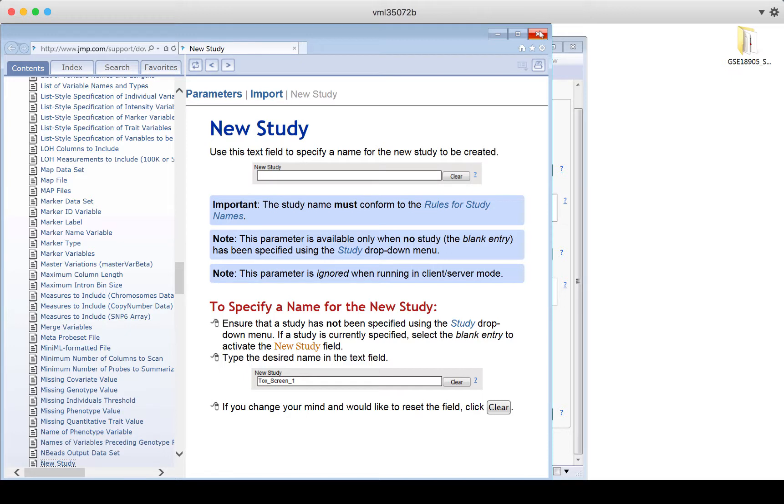Each data type when you're importing has its own quirks. So use the help documentation. It will point out special or different things that you need to know or to do for the particular data type that you want to import.